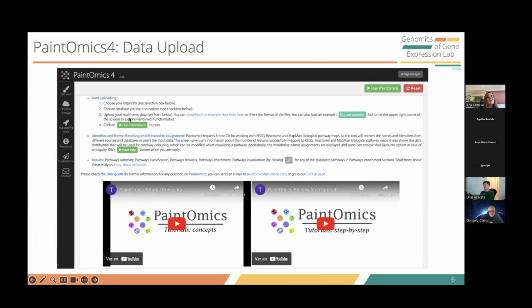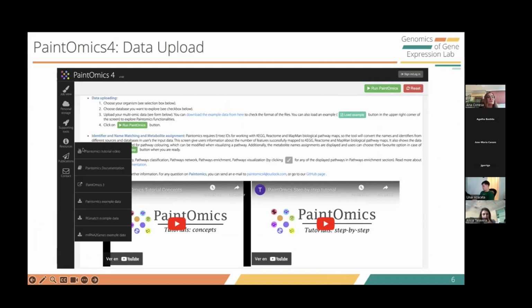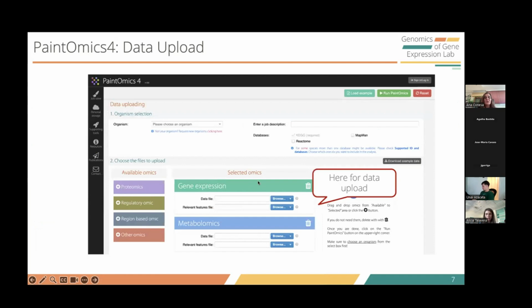So basically, you have a lot of information on PaintOmics. I'm just saying that. You have different tutorials, and you can also come here and find the documentation, the previous versions and example data. So it's a pretty well documented resource. So basically, how it works.